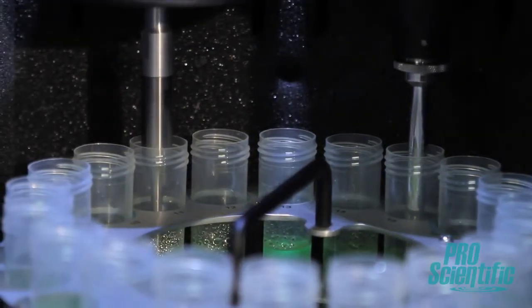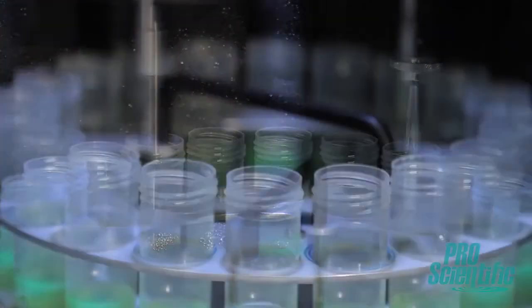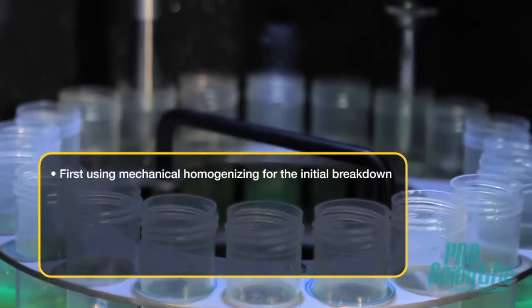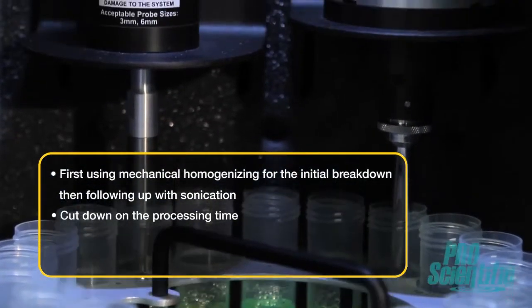The DPS20's dual processing mode takes the benefits of each method and utilizes them together without any of the downsides. By first using mechanical homogenizing for the initial breakdown and then following up with sonication, you cut down on the processing time compared to having used either homogenizing method independently. This means faster, more efficient sample breakdown with less chance of degrading your sample.